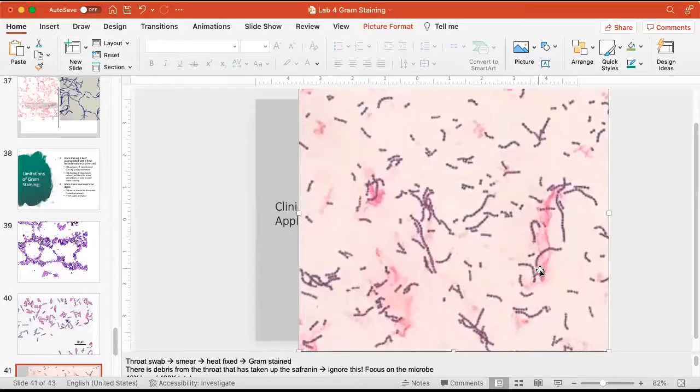Now, what's all this pink material? I see some pink stuff right here. I see a sort of a long string of something that's turned pink. I see some pink stuff over here too, and some pink stuff down here. What is this? What's that right there that's pink? I see some pink over here too. In fact, the back of the slide looks pink. What's all that?